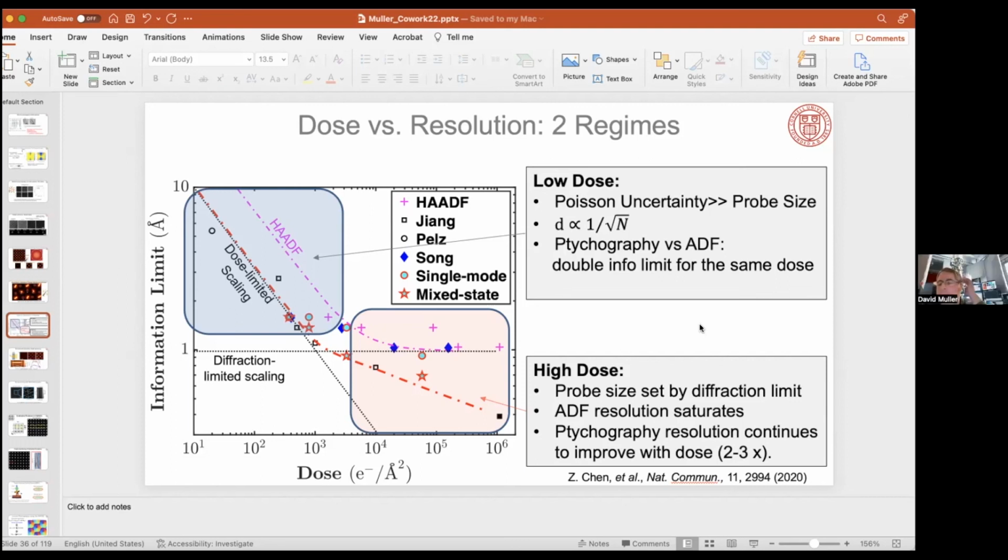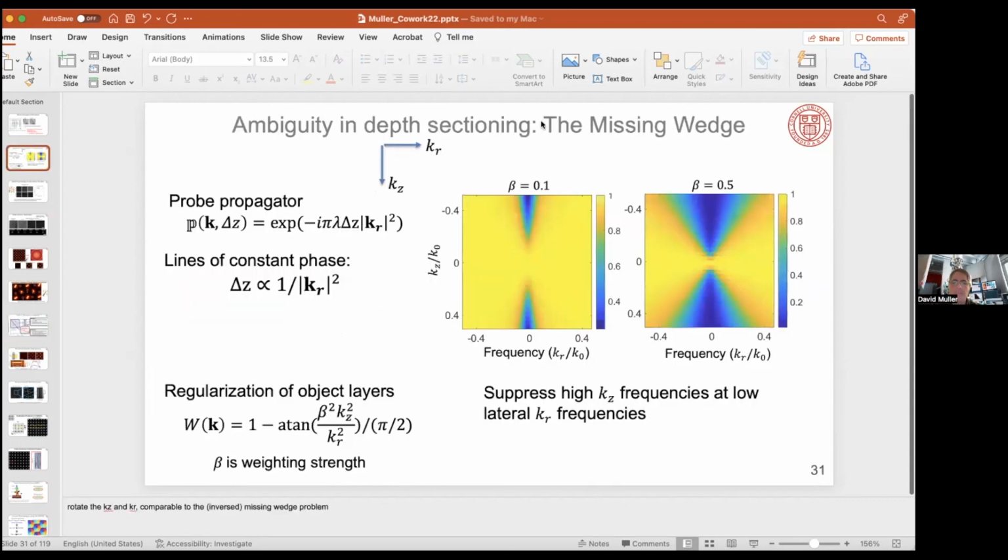Yeah. So the way to sort of think of ptychography is it has a 3D point spread function, and it actually gives you information in the Z direction, but in kind of the shape of a propeller blade. And what that means at small angles is there's a range of angles, and I can reconstruct well within this range here, but I'm missing information up over there. And that missing information leads to an elongation of the object. And this is well known in tomography.